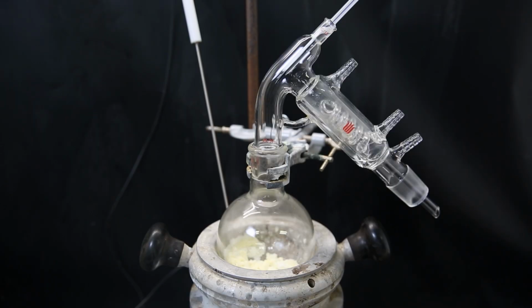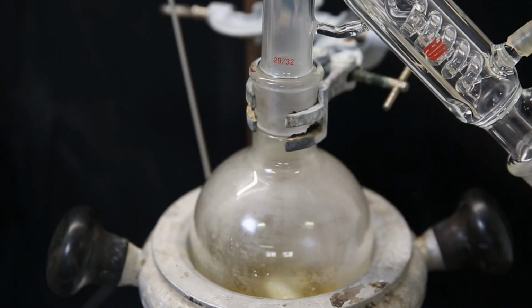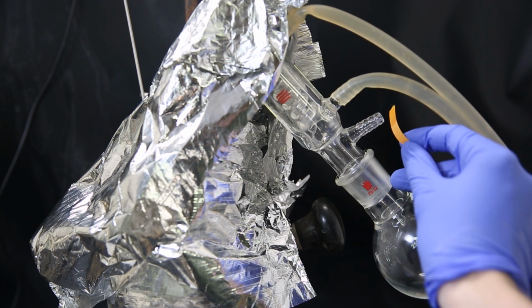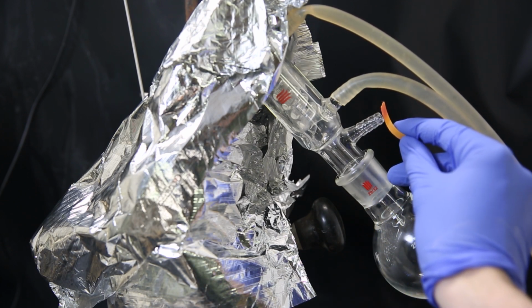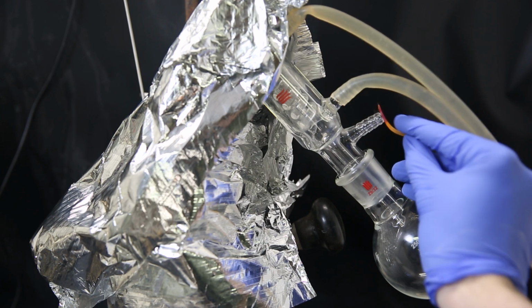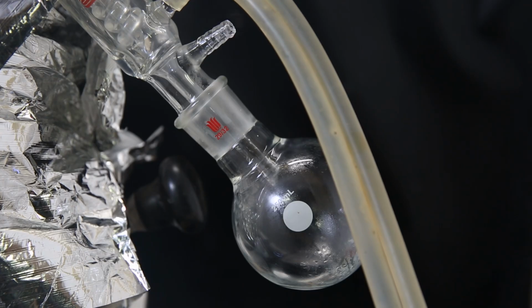I again attach a short path distillation apparatus, but now without a vacuum. The only thing that this reaction requires is heat, so I start heating it to 210 C, and the product starts to melt. I insulate it with some aluminum foil, and when it comes to temperature, we see vapors escaping from the apparatus. I hold a wet pH paper to it, and we see that the fumes are acidic, which confirms that it is hydrochloric acid. Shortly thereafter, the liquid product starts distilling over, and I let it continue until no more product comes over.